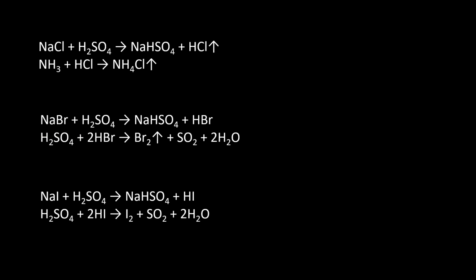So, what are the reactions involved in this dry test? Already I have discussed in my earlier video. Here the first test is chloride ion with sulfuric acid. Here the strong acid releases weak acid, that is hydrochloric acid or hydrogen chloride vapor from the salt. And then this hydrogen chloride vapor, with a glass rod dipped in ammonia, forms dense white fumes of ammonium chloride.